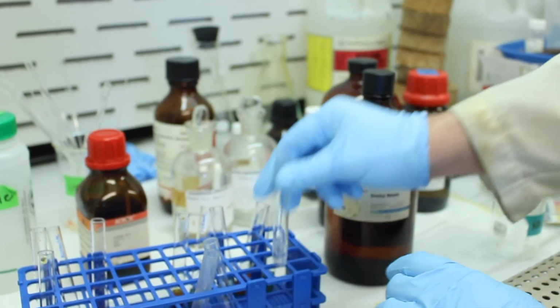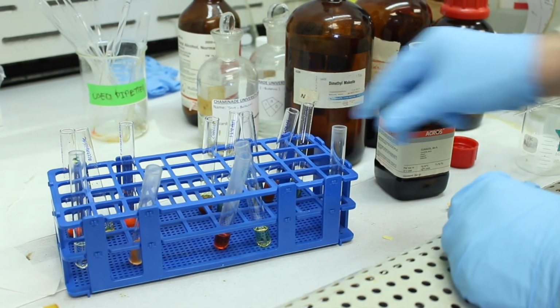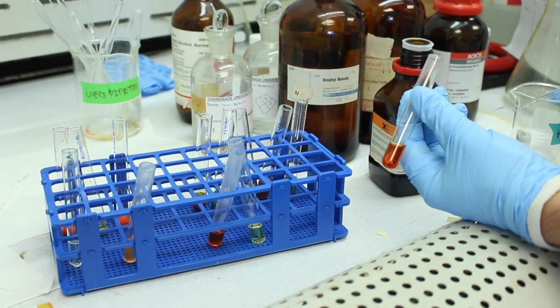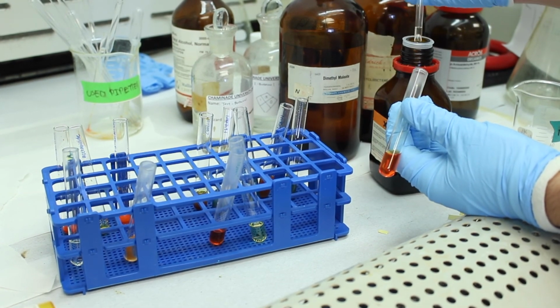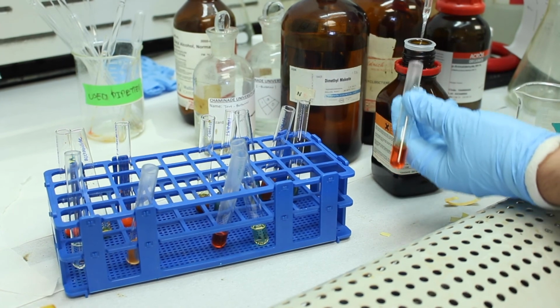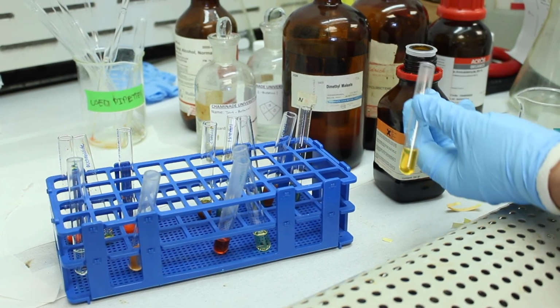It probably works better if you put this in immediately as you react it. Okay, so we've made up a new test tube here. This is DCM and bromine. We're going to redo the test, so we're going to add some guaiacol, and I'm going to quickly add the guaiacol, and then add the pH paper very quickly. It's a different pH paper. Sometimes they don't last too long. So there's our guaiacol.